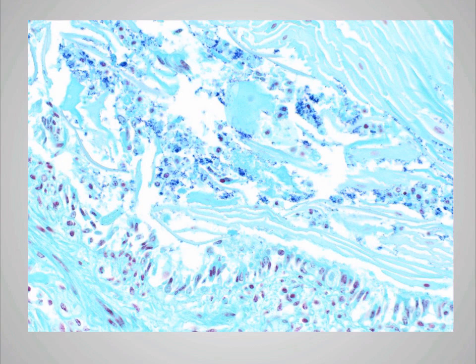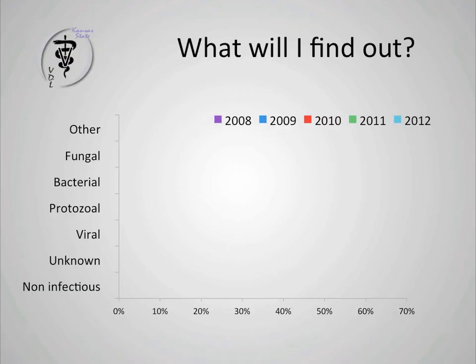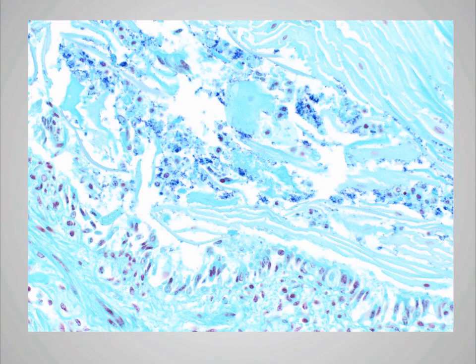And this is a Gram stain of that same bronchiole. This is the wall right here, the respiratory epithelium, and all of this was debris in the airway. All the little tiny blue dots, those are all bacterial organisms. And actually, something Dr. Lubers reminded me to point out about this case. They cultured Trueperella, or do you want to? Okay, never mind, I'm going to give away his. Okay, any questions about that portion?